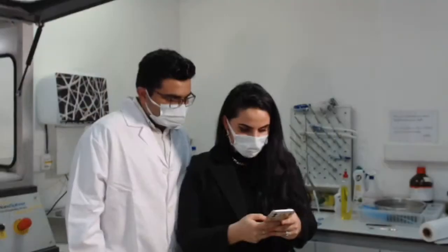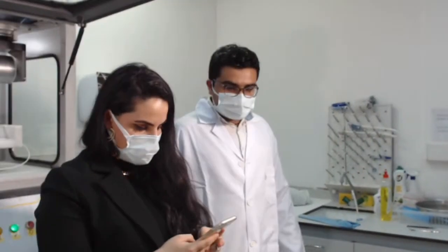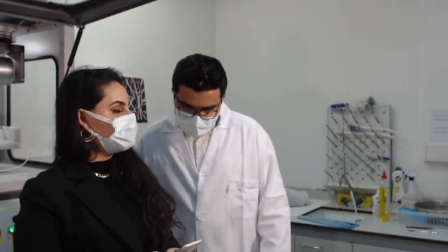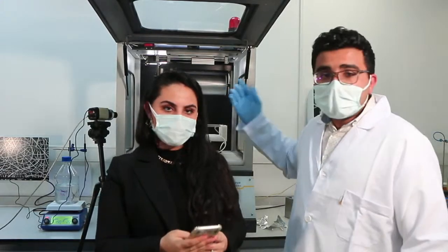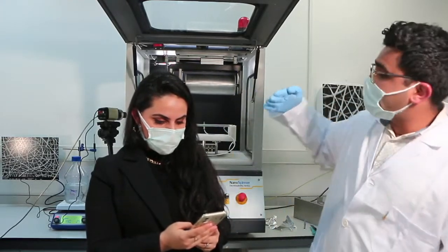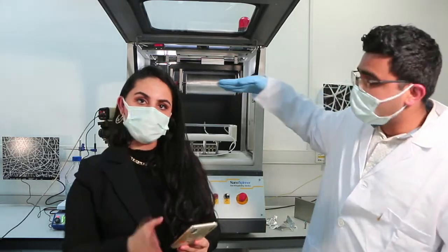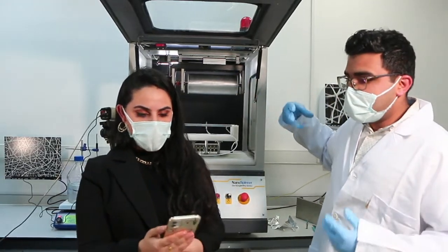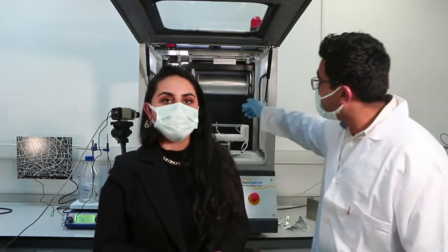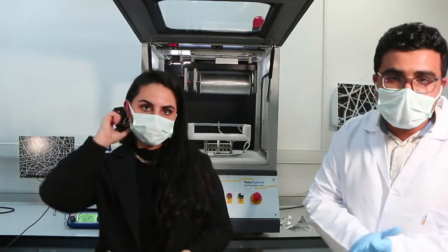Okay. So basically, we are going to answer the first question, from Rajul Islam: how can we adjust homogeneity? You can adjust homogeneity with the uniaxial motion in the machine. When you have electrospinning from the jet, it's very crucial that the collector is moving to and fro, like we mentioned earlier. It should have a stroke speed, meaning how much distance it travels and at what rate it goes back and forth, so that the jets properly latch periodically onto the collector, enabling homogenization. I hope this answers your question.